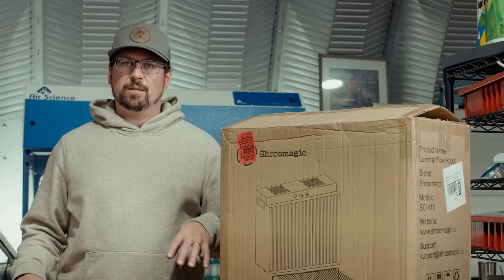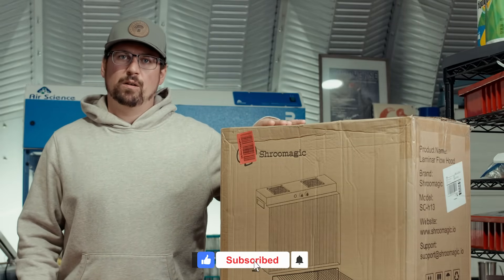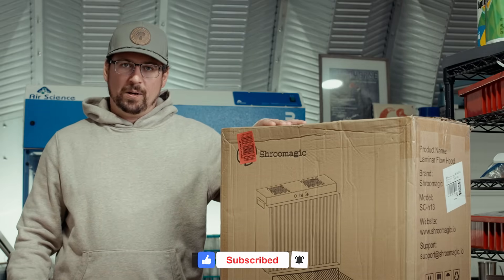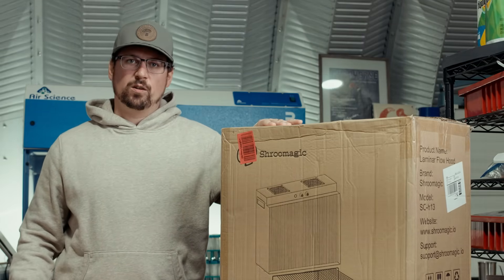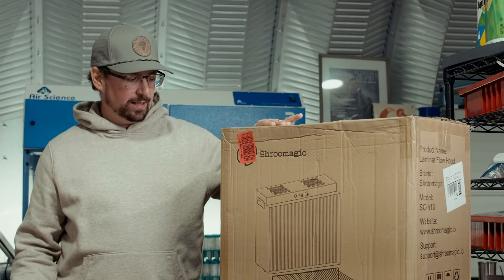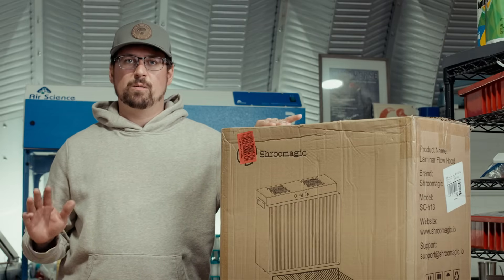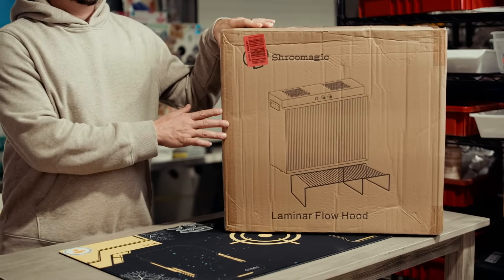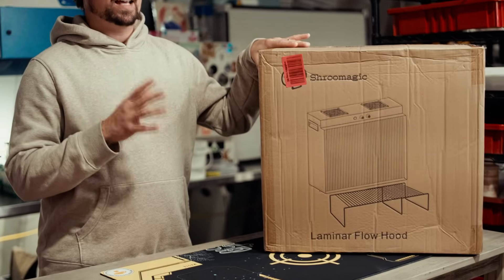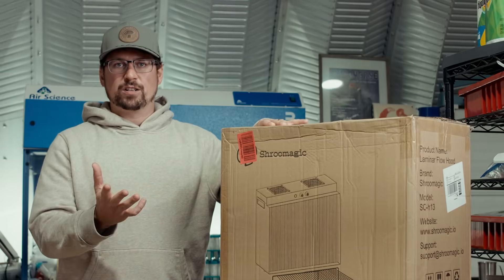What's up mushroom fam, it's Gary with Fresh on the Farm Fungi. Today I'm going to be reviewing the Shroomagic HEPA filter. This is one of the coolest hobbyist HEPA filters I found on the market, and this company was kind enough to send me one to do a review video. I'm going to do the unboxing, my initial impressions, and then a test comparison to test the sterility of this in action.